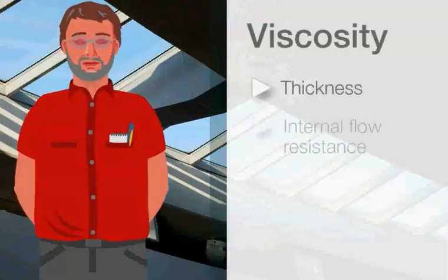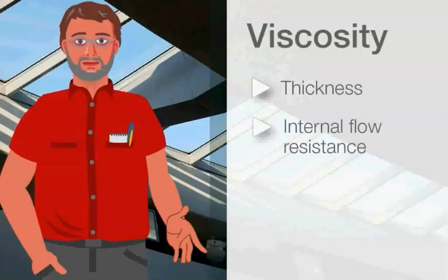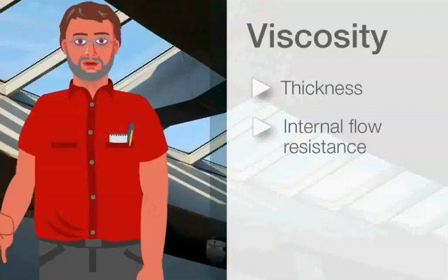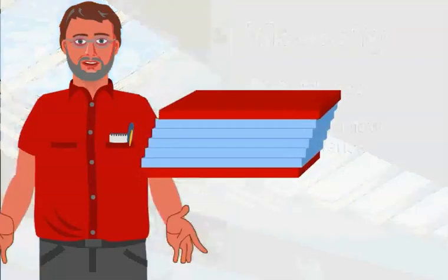Viscosity is the thickness, the internal flow resistance of a liquid. First, let's take a look at the model we use for scientifically determining viscosity.